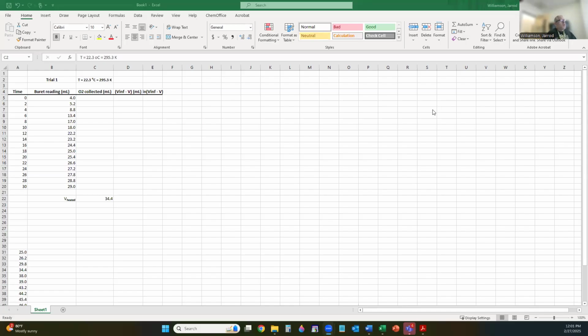Okay, this is Dr. Williamson. I'm going to show you how to do the calculations on Excel and the graphing for one of the trials for the decomposition of hydrogen peroxide lab, which is supposed to be a first order reaction.